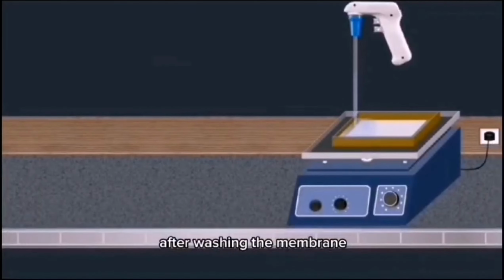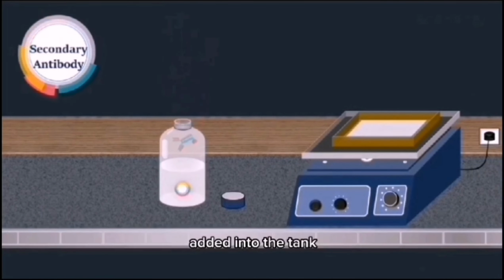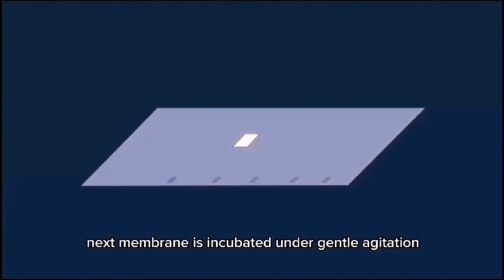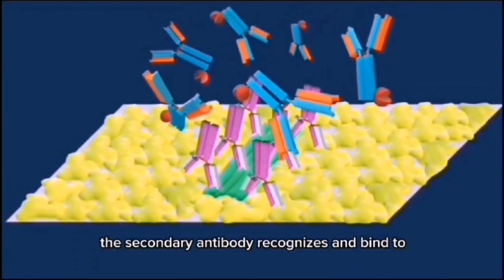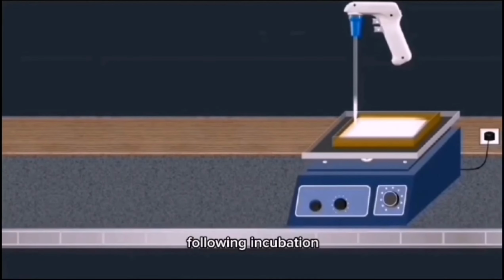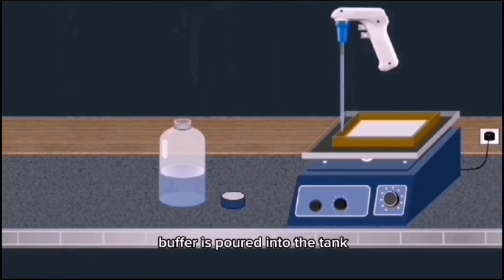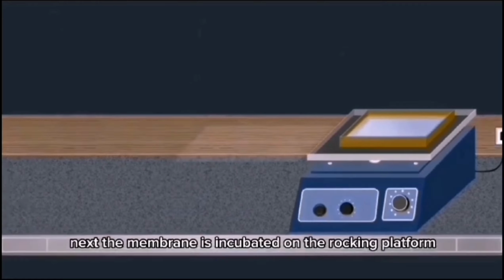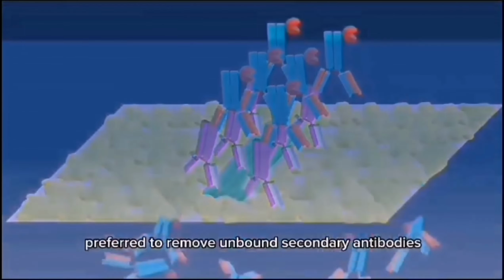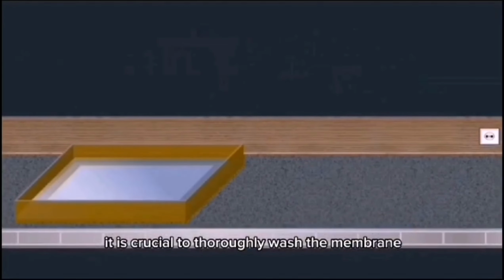After washing the membrane, the wash buffer is removed, then a solution containing the secondary antibody is added into the tank. Next, the membrane is incubated under gentle agitation. The secondary antibody recognizes and binds to the specific portion of the primary antibody. Following incubation, the secondary antibody solution is removed, then the wash buffer is poured into the tank. Next, the membrane is incubated on the rocking platform. The membrane is washed several times in wash buffer to remove unbound secondary antibodies. It is crucial to thoroughly wash the membrane at this step.